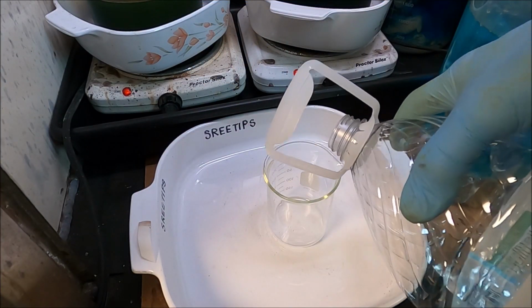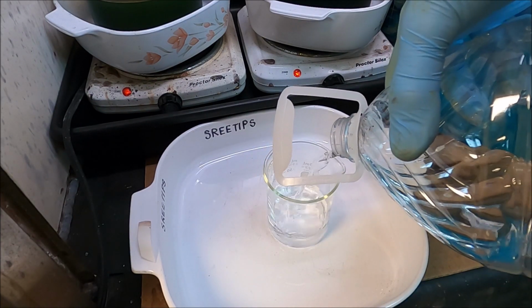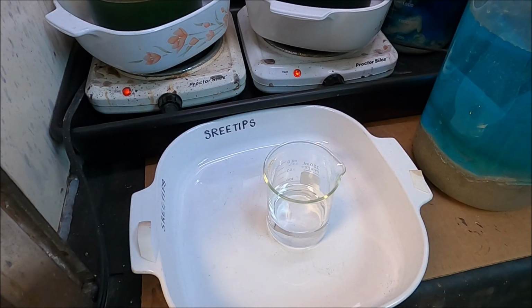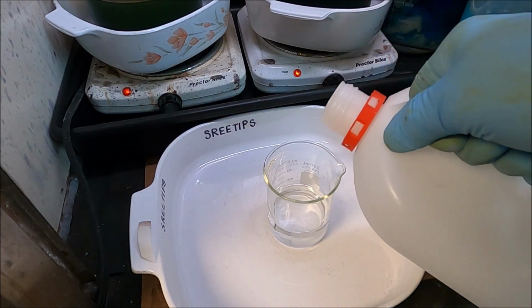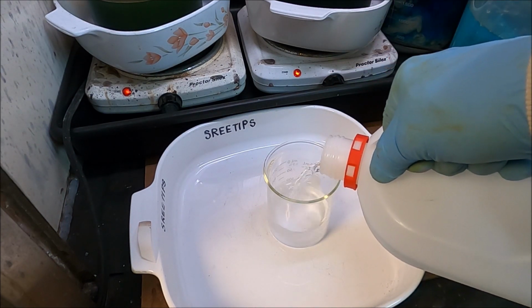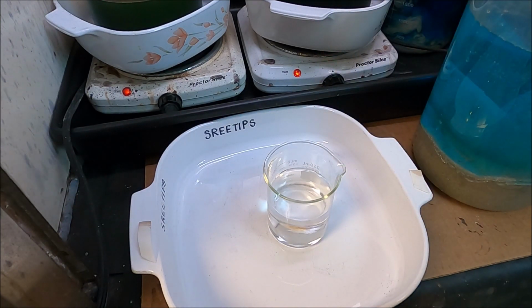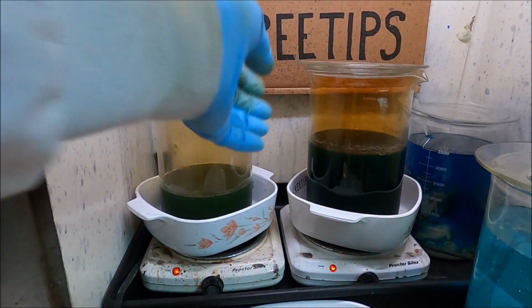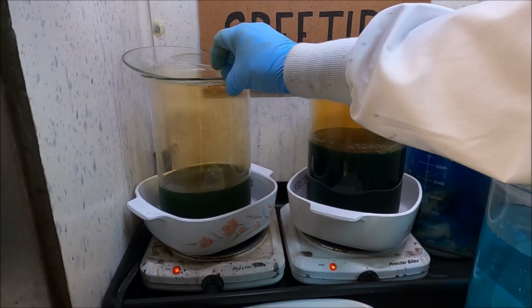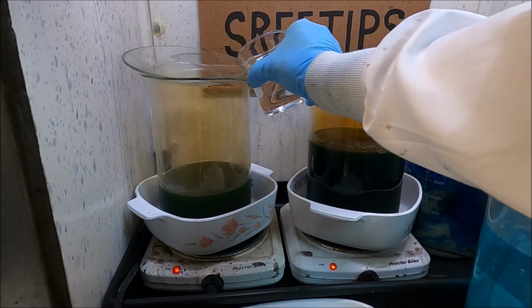Add some distilled water to this beaker here. And then I'm going to put some nitric acid in there with it. And we'll add this dilute nitric acid to our finely divided solids up here in this beaker. There we go. Pour it in real slow.